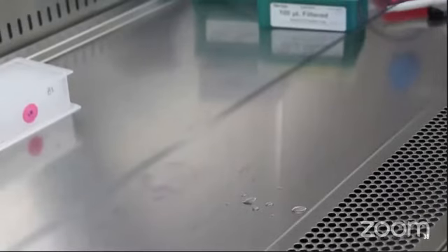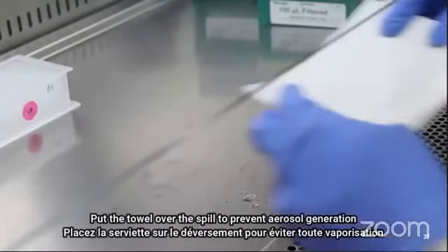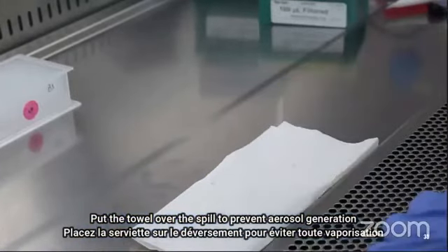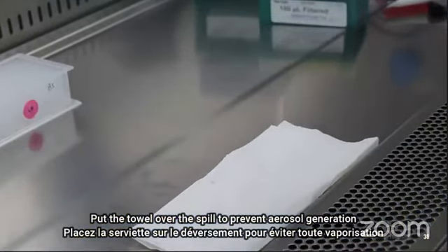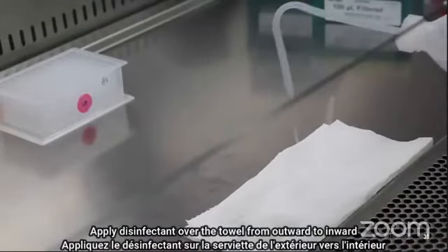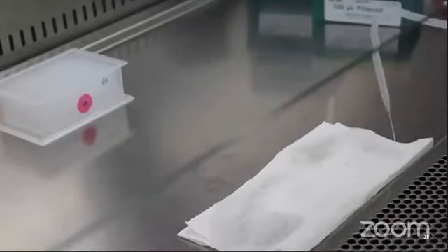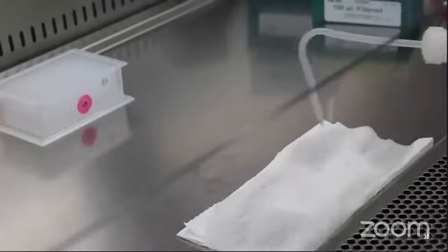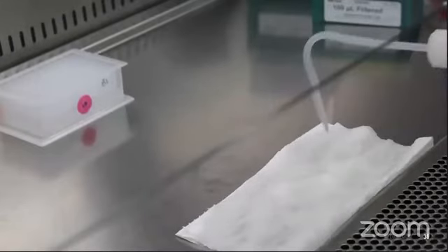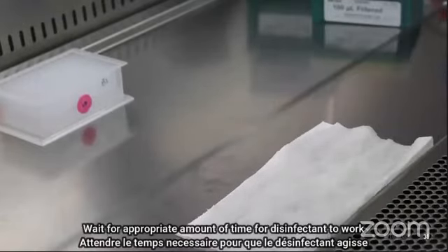Now put paper towel or absorbent paper to prevent any aerosol generation. Apply the disinfectant from outward to inward. After the application of the disinfectant, wait for some time.